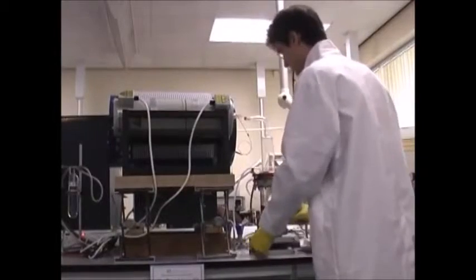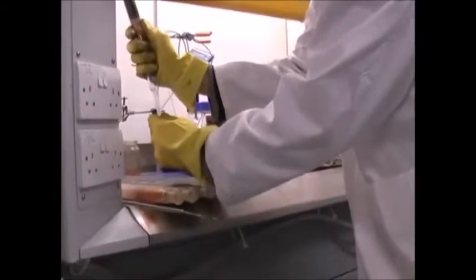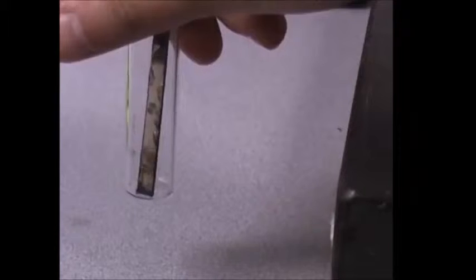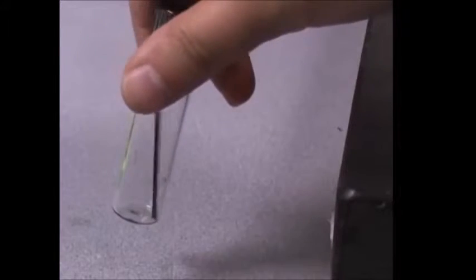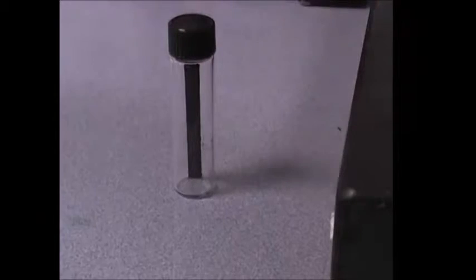Once the experiment is finished, he collects nanotubes from the soot stuck on the tube sides, and also the base, previously clean, which now has nanotubes all over it. CVD is probably the most promising method to produce carbon nanotubes for industrial use.